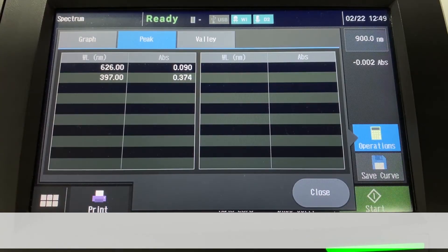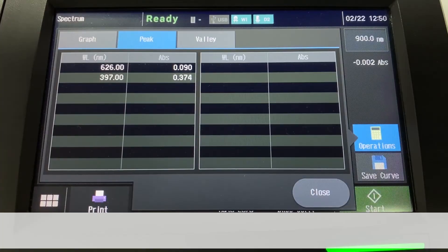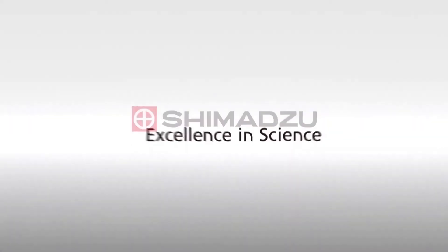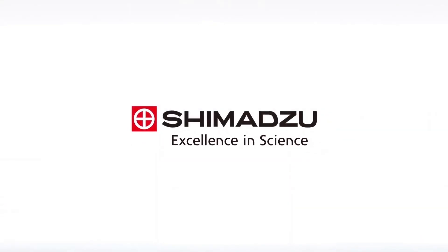That is how spectrum measurement can be done on the UV-1900i stand-alone operation. Excellent in Science. Shimadzu.